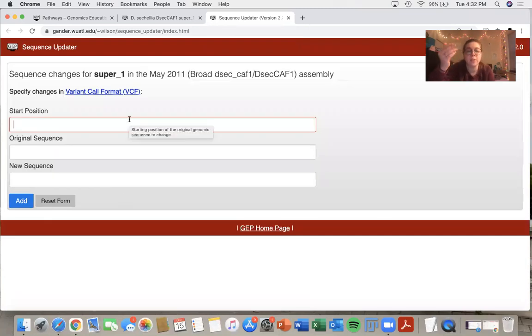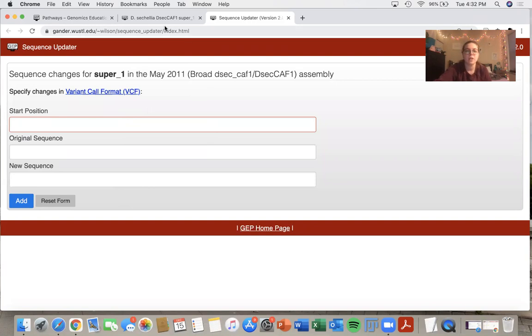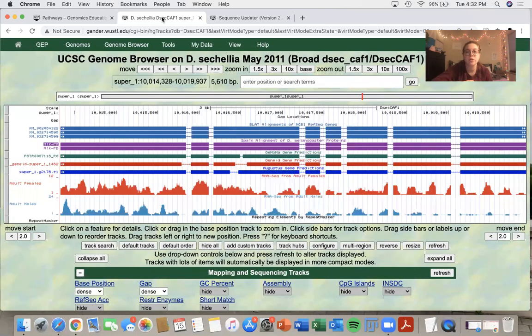So now it's asking me to specify what the sequence changes are in this scaffold that I want to change. So now I will go back to the genome browser to look for those.